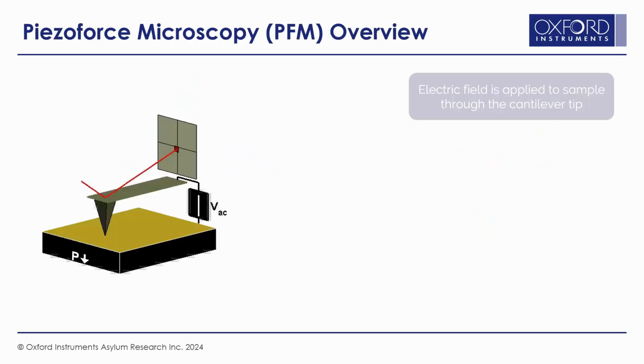So there can be a few different phenomena that affect the cantilever bending, like tip-sample friction. Another factor could be electrostatics between the cantilever and sample. And the third factor would be in-plane response of the sample affecting the measurement. I'm going to give you a quick overview here of piezo force microscopy, because with this technique, you can actually observe all three artifacts. We've taken some data just to compare OBD and QPDI, specifically looking through the lens of PFM, because it exposes the differences quite nicely.